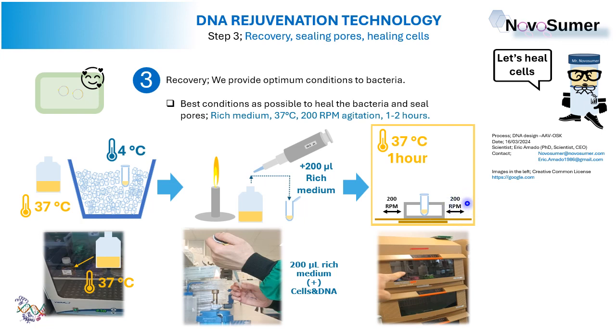It's a gentle agitation. So what we have to do is place the Eppendorf tube with the cells, with DNA, and with the rich medium inside the chamber.